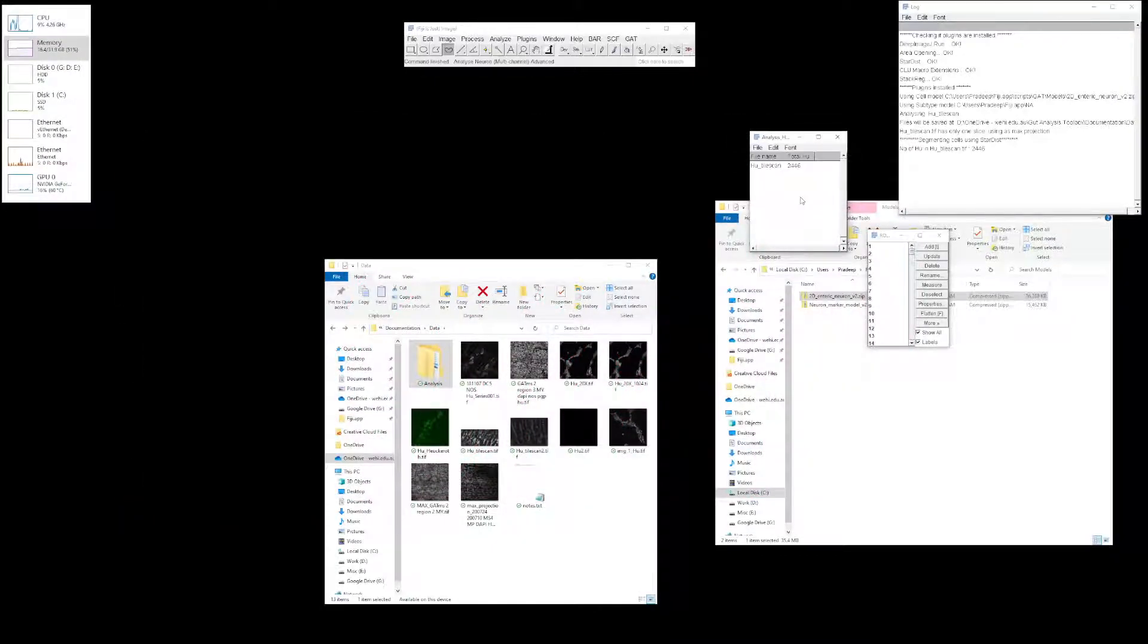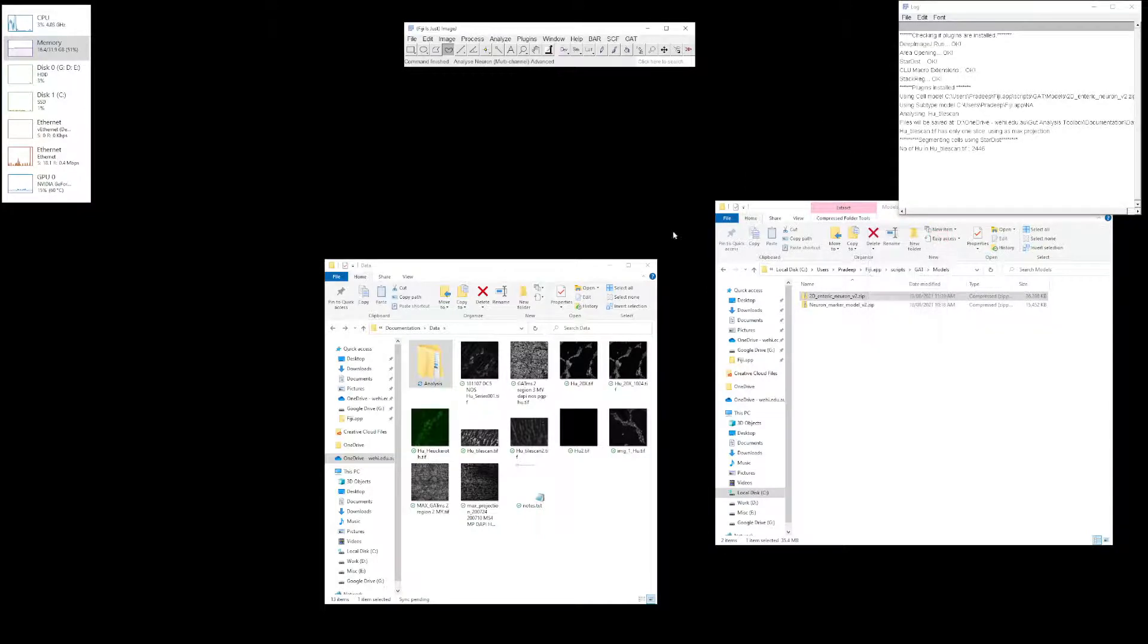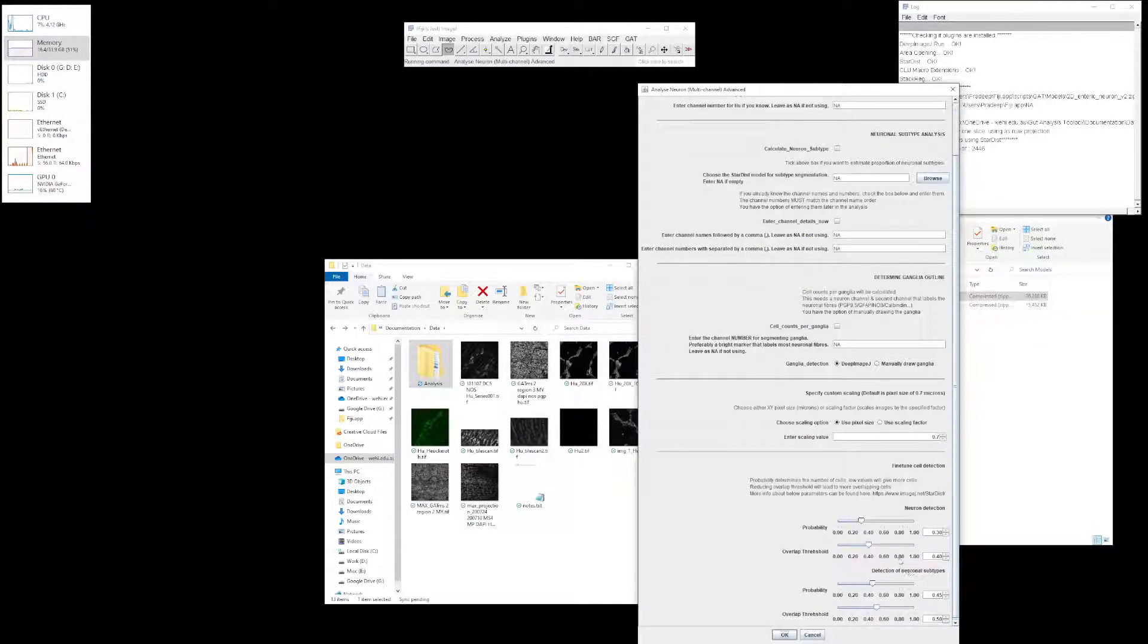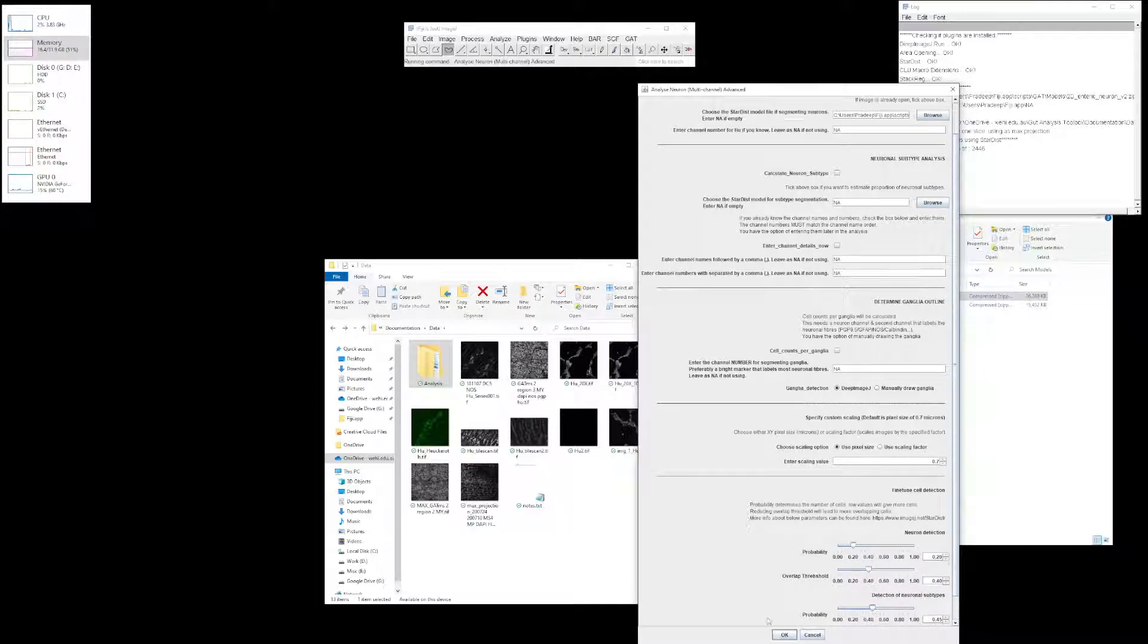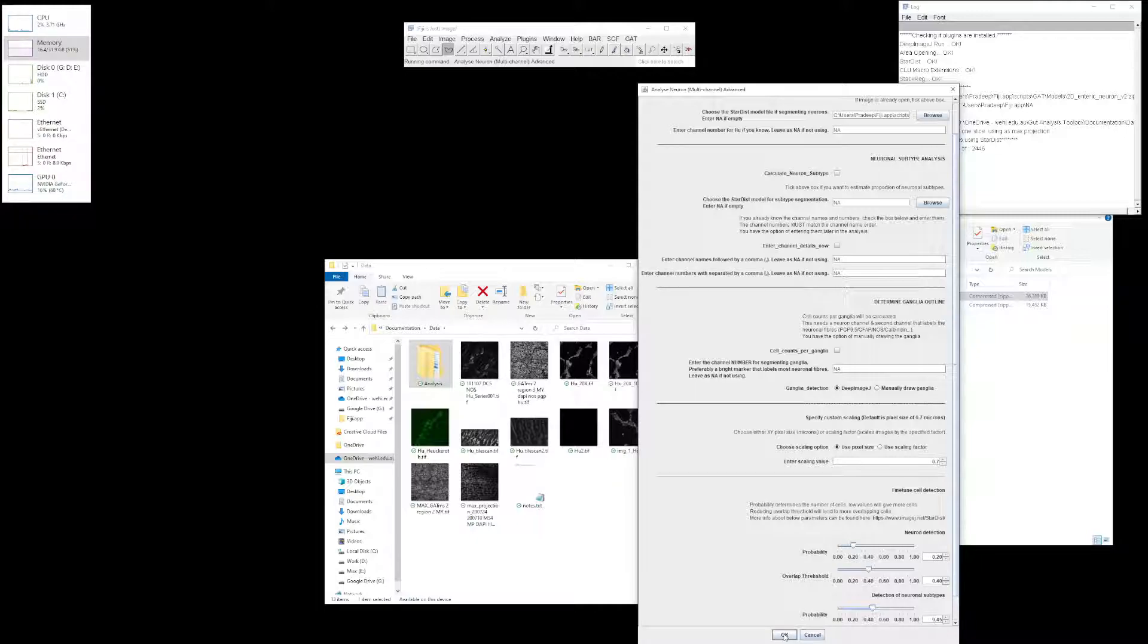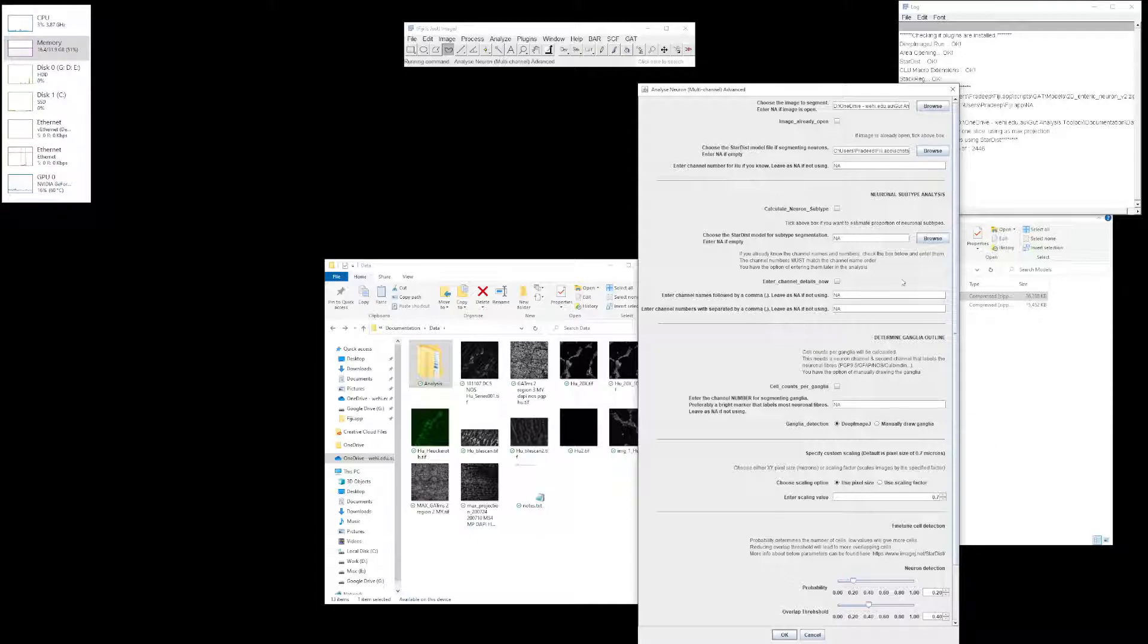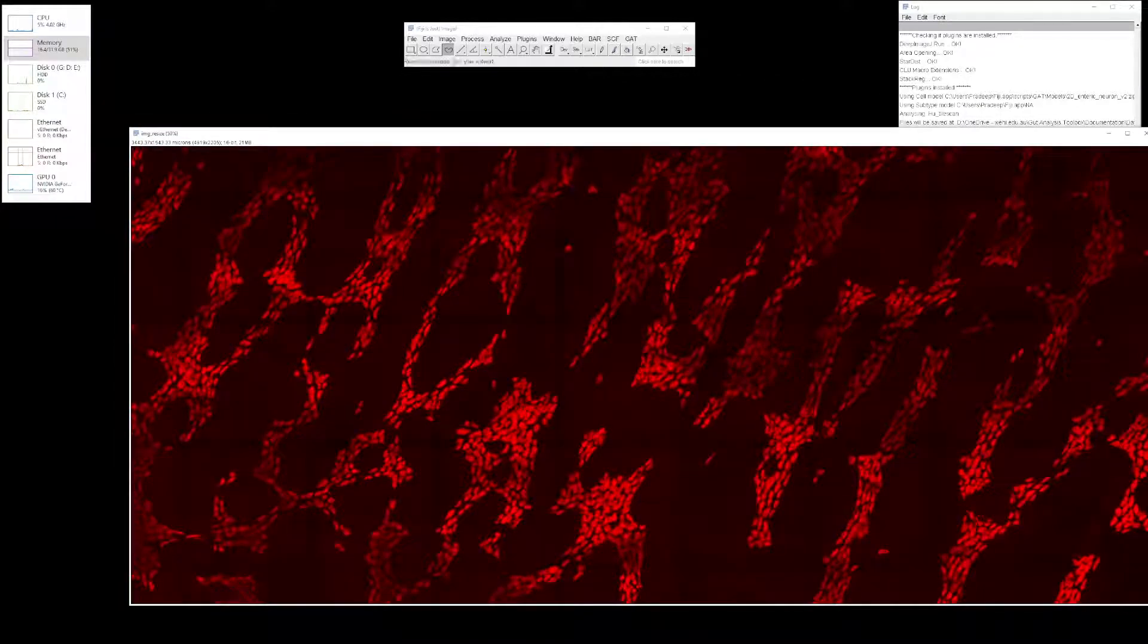In this case, I want to try to reduce my probability again. I'll go to advanced and go to the bottom. I'll reduce it to maybe 0.2. This is quite trial and error. Once you figure out what works, you can stick to that. One advantage is when you do your analysis, once you've entered the parameters here, you don't need to change it every time. Fiji remembers it. Let's see if this improves it.